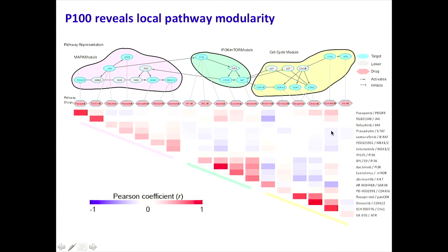So we can now represent that as a correlation plot, or a core plot, if you're familiar with that terminology. What we have, on both the x-axis and the y-axis, is the list of drugs that are projecting onto this linear pathway. And here I've shown you the enzymes that they inhibit down along the side. Everything on this diagonal is how well all the replicates of a given drug, whether at 3 or 6 hours, correlate with themselves.